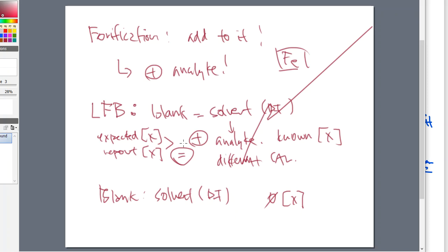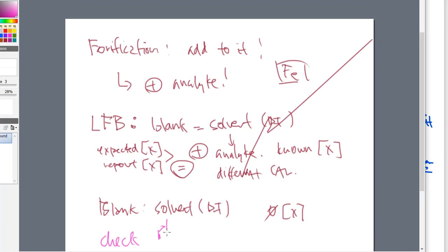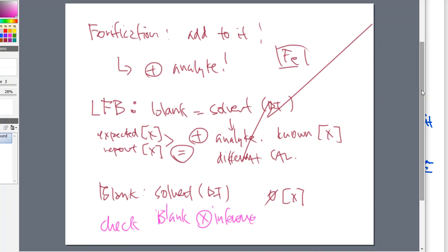All right. So what this is doing is really checking to make sure that the blank doesn't interfere with my sample reporting. That's what this is. My blank, there is no interference at all. Because maybe, just maybe, there could be. Maybe there could be something in that solvent that's interacting with iron and not making it respond very well to the instrument or to the equipment or whatever the case is. I don't know that.